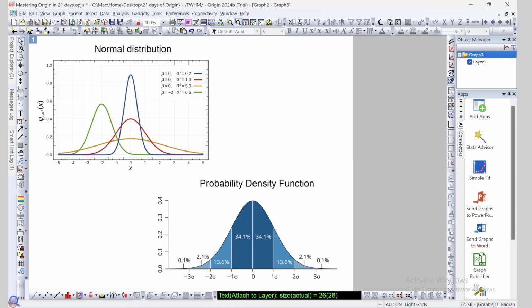When you have a symmetric peak and it is divided into half, 50% goes on the right hand side and 50% goes on the left hand side. So you could see that the maximum probability lies above the full width half maximum. Let's say the full width half maximum would be around here, so I would draw a line here.